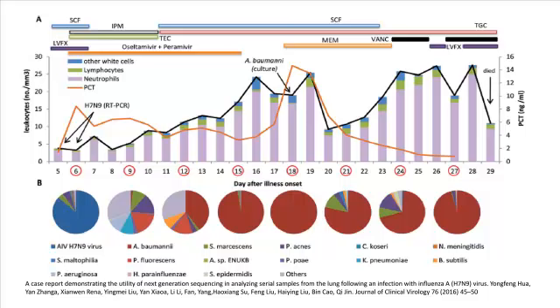Again, just going back to this same chart, if you start to overlay this chart for a bunch of different pigs in a barn, you're going to get a really confusing mess and a lot of frustration trying to understand what's going on in those pigs, what's important.